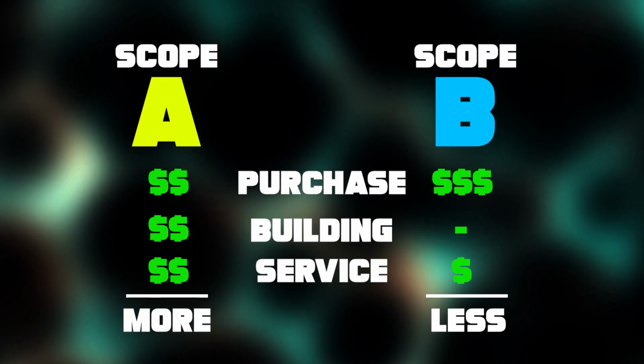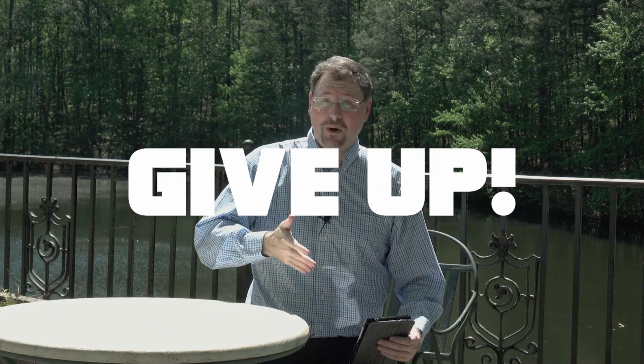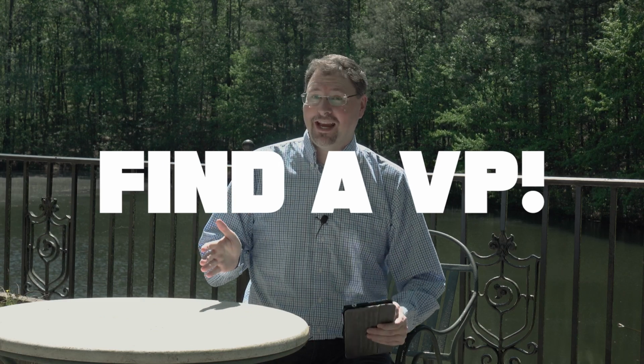This is a pretty common position for microscopists and other lab personnel to get stuck in for all sorts of large purchases. So, what can you do? As far as I can see it, you have 3 main options. Number 1, give up and purchase Microscope A, which is cheaper to purchase but more expensive to own. Number 2, keep going up the management ladder until you find someone who is interested in hearing that Microscope B is actually cheaper to own.